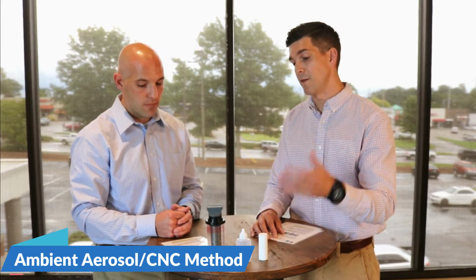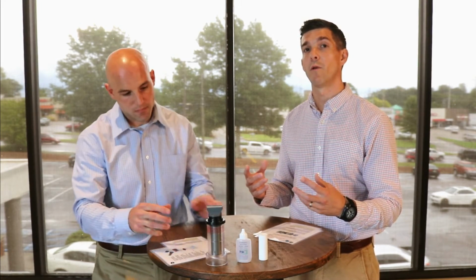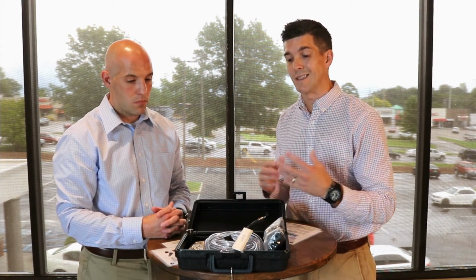Yeah, that's awesome. And obviously the wick's got to saturate for a certain amount of time and so forth. So a number of steps you have to go through just to get the alcohol step ready for testing. So the next big thing is a consumable that we would refer to as probes or probe components. And we have a great video that you can check out on the full details around probing respirators. So check that Facts and Fit Testing video out there. But what Booth's put out for us here is the components that go into running an ambient aerosol instrument.